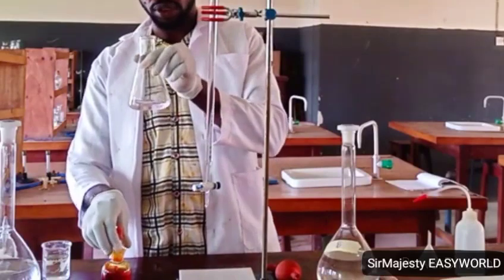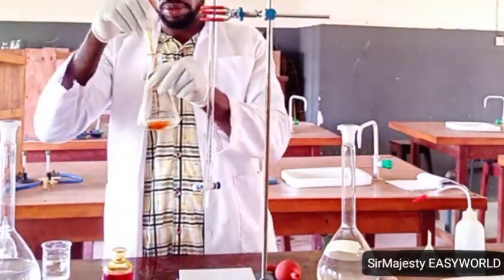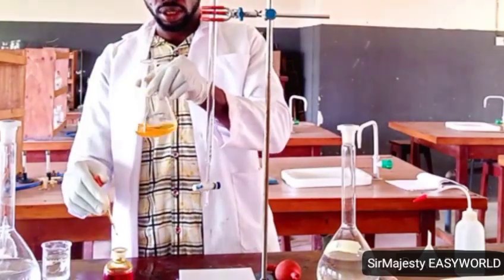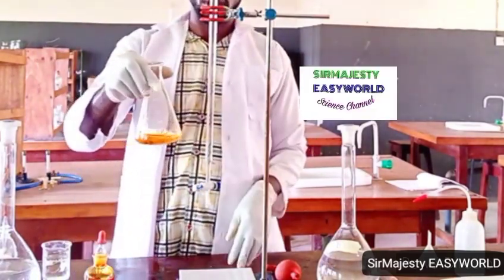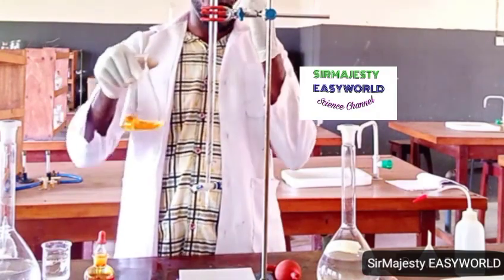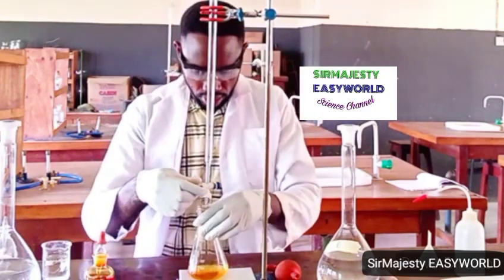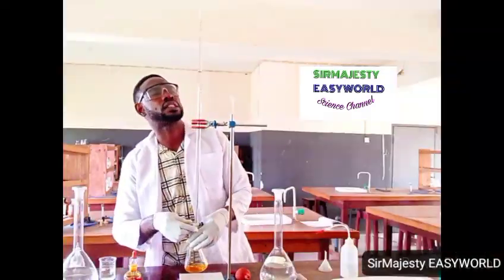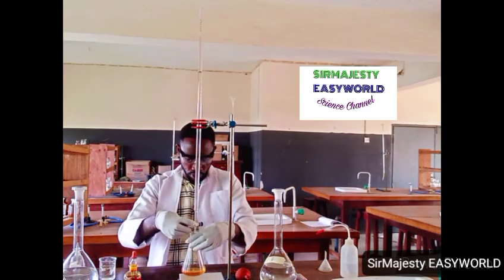Then to proceed further, I will now add the second indicator, methyl orange. See, it's yellow. I will now continue the titration until it becomes orange. I'll take the correct reading. Remember, we stopped at 10.6. That's the phenolphthalein endpoint.